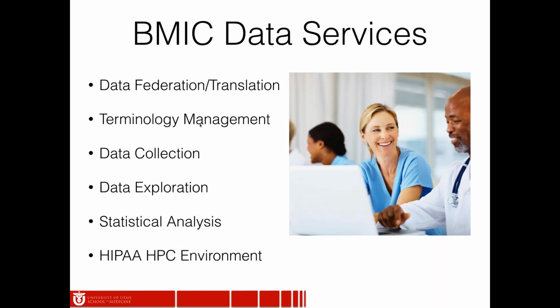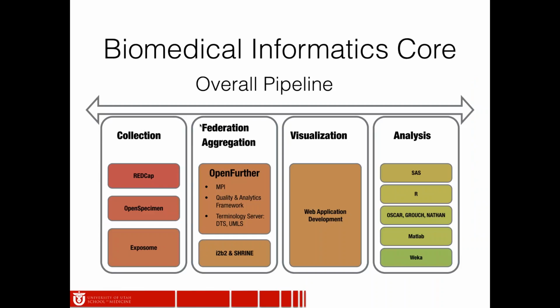So part of this is that our data services includes federation and translation, terminology management, data collection, exploration, analysis, and we also work within a high-performance computing HIPAA-compliant environment as well. So that builds up sort of a pipeline of applications and systems that work to support our researchers throughout their entire projects, whether that be just pure cohort identification or trying to actually define data sets in translation using such things like OpenSpecimen for biospecimen data.